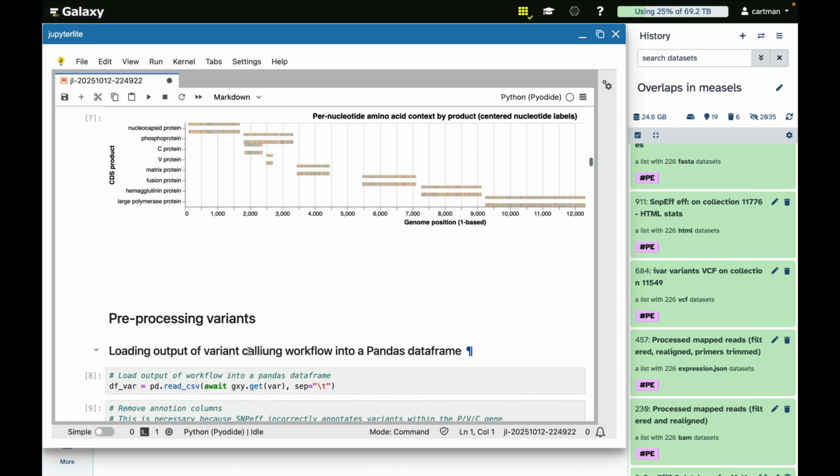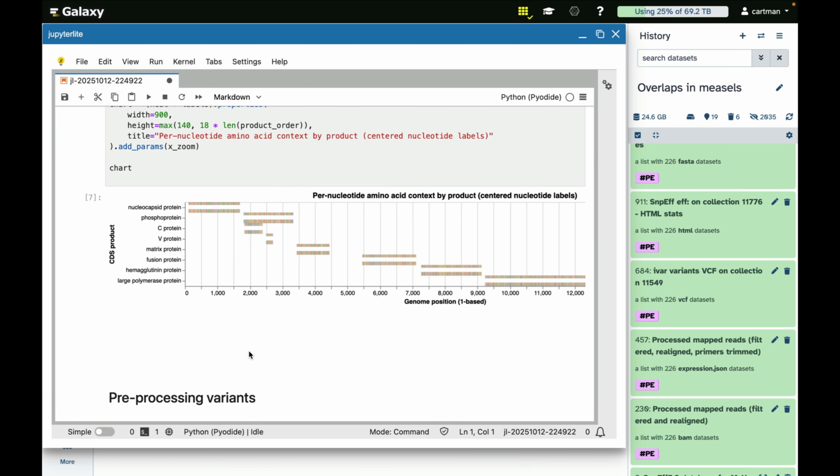One of the problems with ChatGPT is that it's a great tool, but you can never really trust it. Especially for complex things like this analysis, you need to have some way of checking whether the code that it's producing actually makes sense. The way we do this checking in this notebook is that for each step of the analysis, we ask ChatGPT, and then we do this in Python to visualize the results.